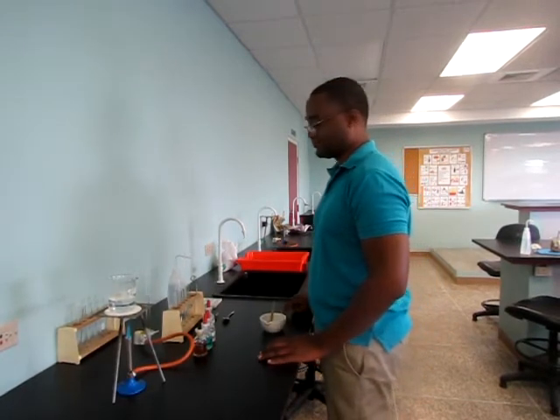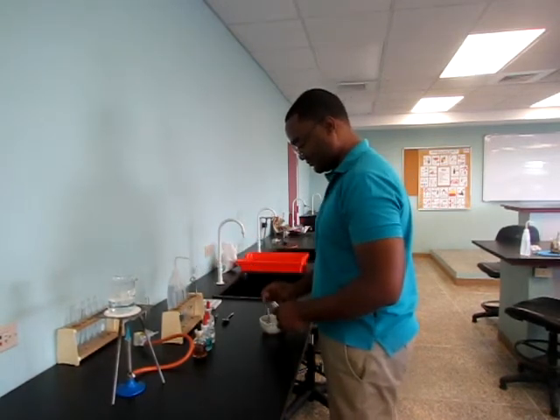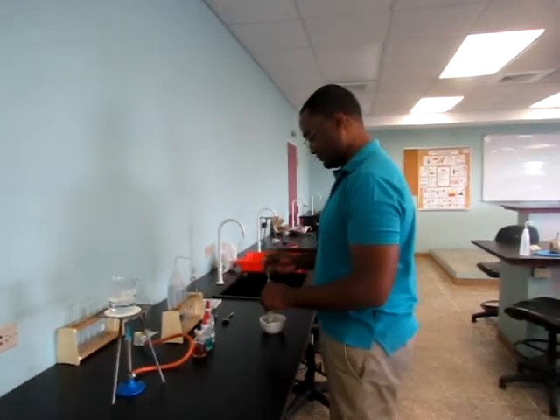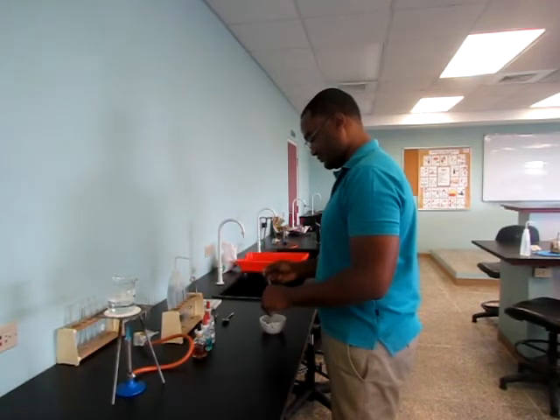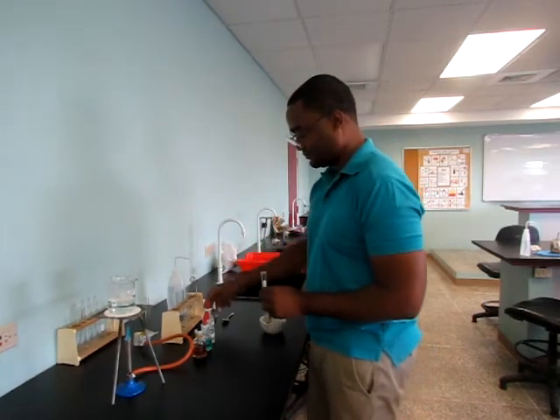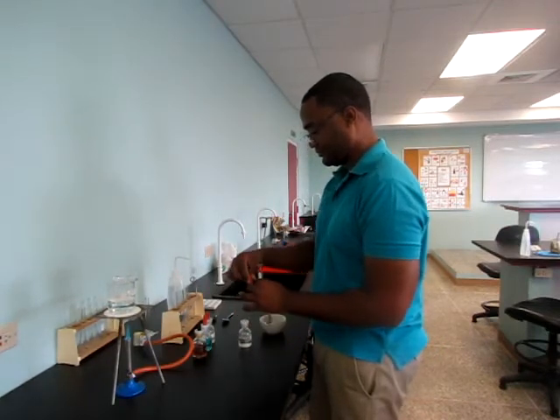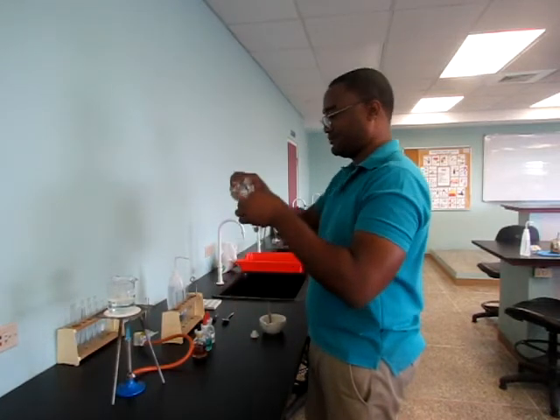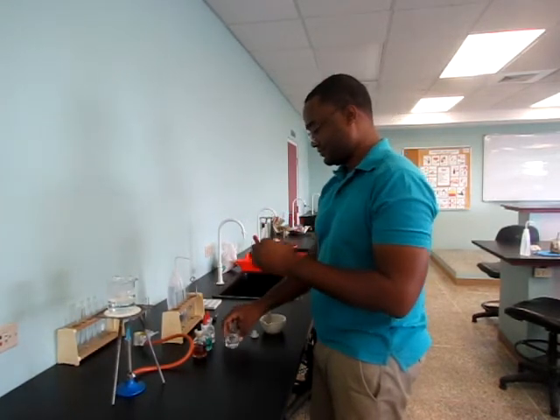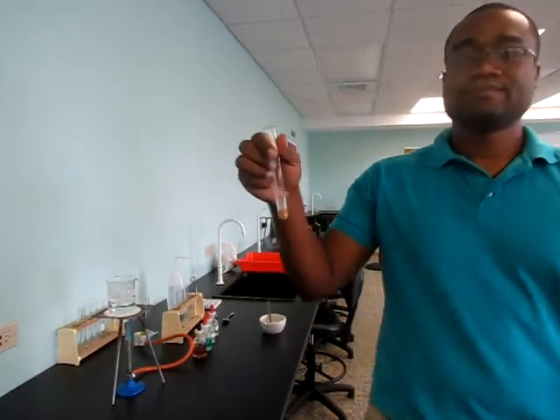We are now going to test for fats, which is the emulsion test. Firstly, we are going to add 1cm³ of the ground food into the test tube. We are now going to add 2cm³ of alcohol, for example ethanol. Now put a thumb over the top of the test tube and shake thoroughly.